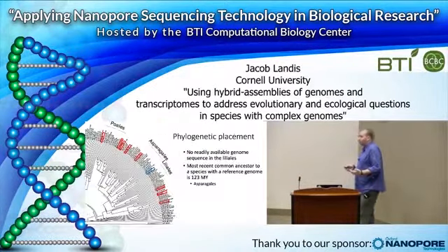And so one other thing I want to talk about before we get into what we've been doing with trying to assemble these large genomes, so again 5.5 gigabases, there's many issues that are very well known. Many assemblers that are out there are designed for genomes the same size or smaller than the human genome, so 3 gigabases or less. And then the large genomes themselves are more repetitive, but have about the same number of genes as smaller genomes.